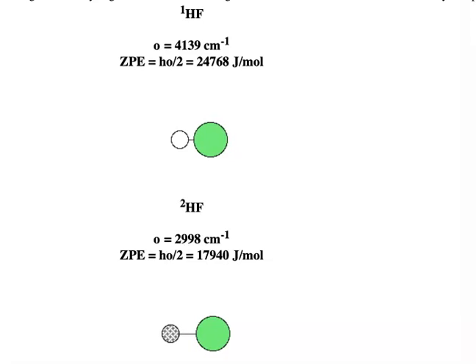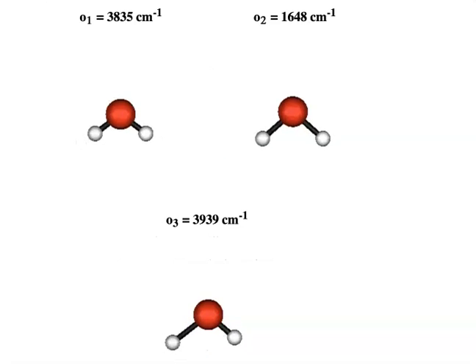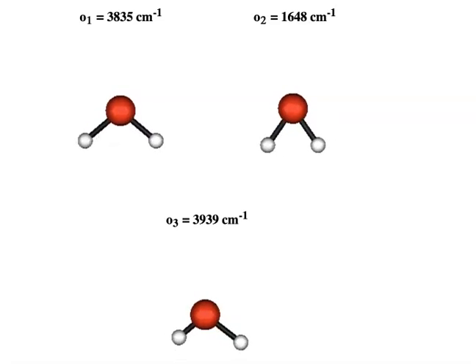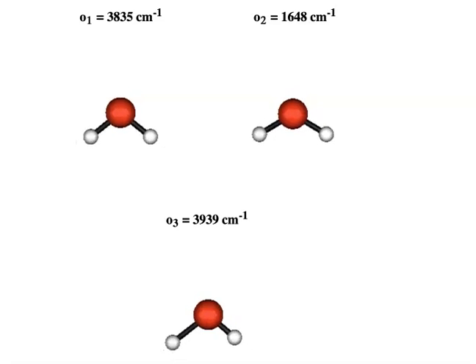So in IR, what's happening is that because of the molecule's vibration, it'll interact with electromagnetic radiation in the IR spectrum in a really particular way that we're going to take advantage of, and hopefully it'll be a little clearer in these next couple of slides. So here's water, which is a compound that's of a little bit more interest to us as organic chemists. And one of the things that you'll notice is that as a molecule gets a little bit more complex, the number of vibrations available to it goes up.